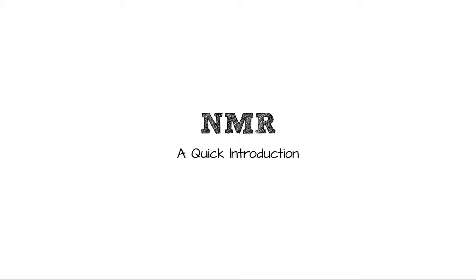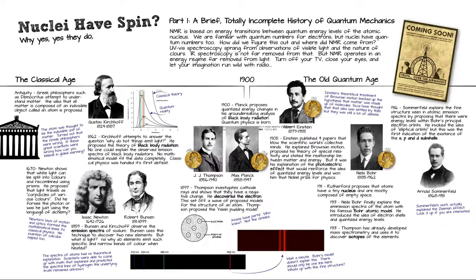All right, I'd like to give you a quick introduction into NMR spectroscopy. We've already discussed the details of Fourier transform infrared spectroscopy, and we've been introduced to NMR already in class. I want to give you some information that we haven't had in class about the instrument and the history of NMR, to sort of set it in a background of the progress of science, if you will. So sit back and enjoy.